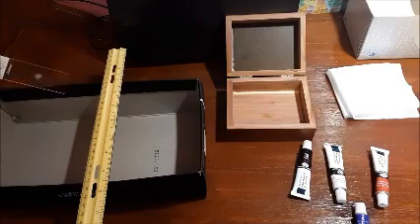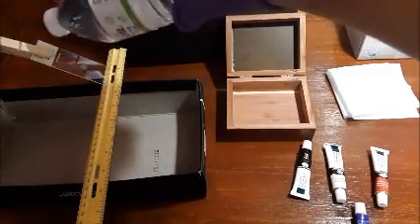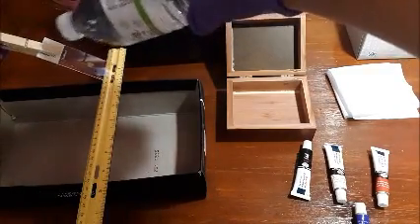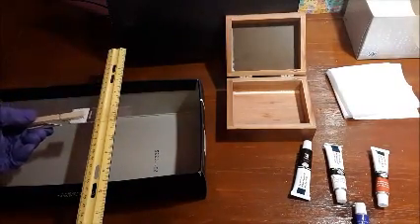And while you're still holding the slide, you're going to rinse it off in a gentle stream of water to get that excess ethanol off. Once you've done that, put the slide back on the stain tray.